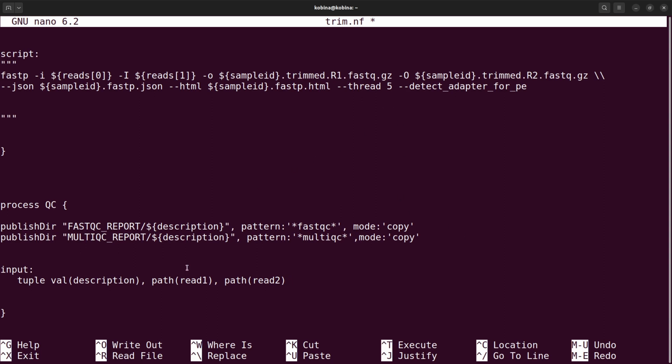Take note that with these things, you always have to read the Nextflow documentation. It tells you what to do. So based on the processing you are doing, you need to make sure you specify the format in the process. From the channels, you need to make sure how the data is being presented or displayed. You specify the appropriate format in the input section of the process, which is going to process those files. It's very, very important.